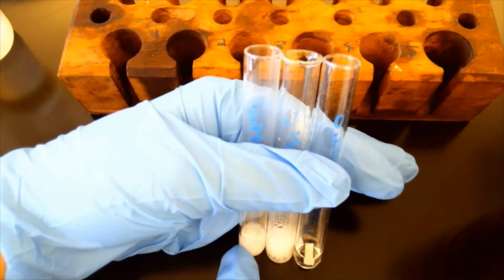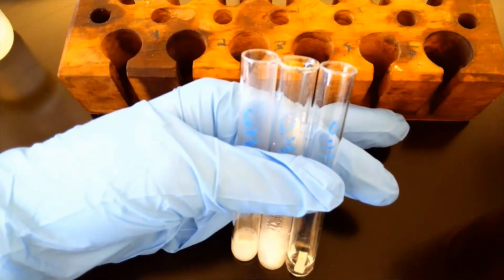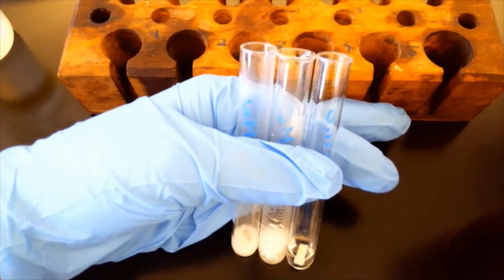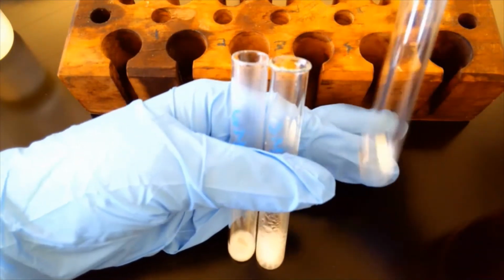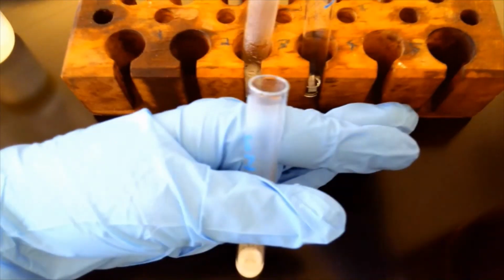So 6 molar the most. This is actually really hot. Then we have our 3 molar, again hot and vigorous as well, and 0.1, not much is happening. So I am actually going to move these to the test tube rack now because they are getting uncomfortable to handle. It is that much heat. So there goes our 0.1, our 3 molar, oops, sorry, didn't mean to hit that on you, and our 6 molar. So the one that is going the most is 6, then 3, and then 0.1.